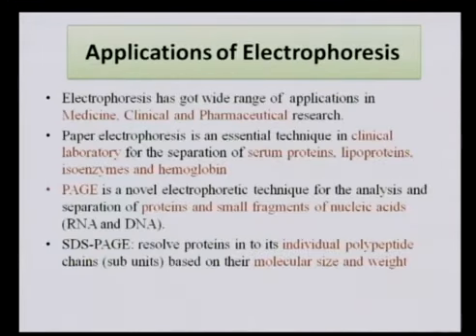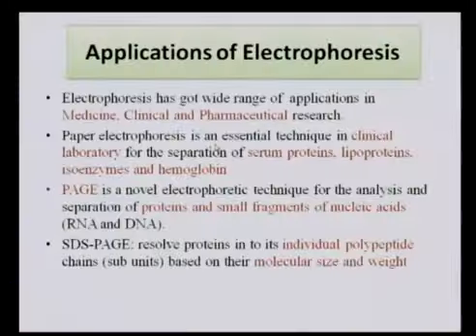So coming to the application part of electrophoresis, now we will be covering the applications of all electrophoresis techniques, ranging from paper electrophoresis, agarose gel electrophoresis, PAGE, SDS-PAGE, IEF, and 2D. So we will cover all the applications of the various electrophoresis techniques we have discussed so far. As we said, electrophoresis has major applications in separations, especially in medicine, clinical and pharmaceutical research.